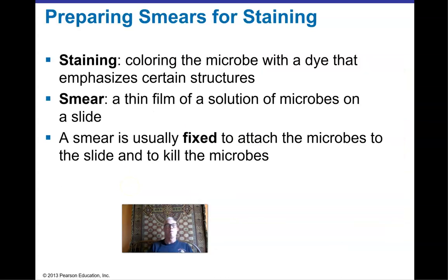Okay, so that pretty much wraps up our discussion of different types of microscopy. Let's talk more generally about how microbiologists will actually conduct their staining and their microscope work. Staining, again, most structures that we're interested in looking at have no contrast of their own, and we need to add stains to make them visible in the microscope. Again, typically a light microscope or a fluorescence microscope.